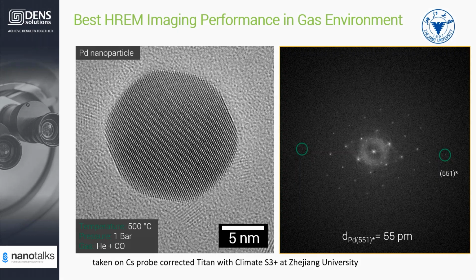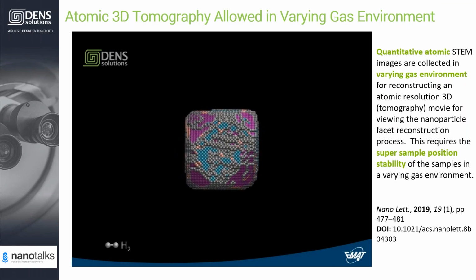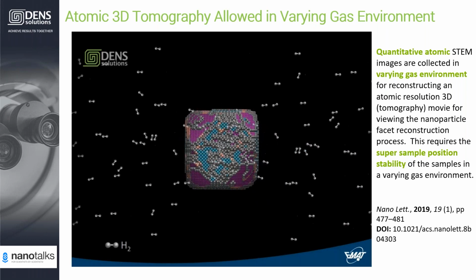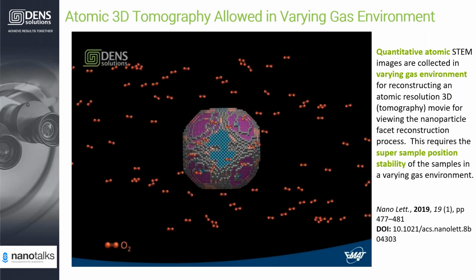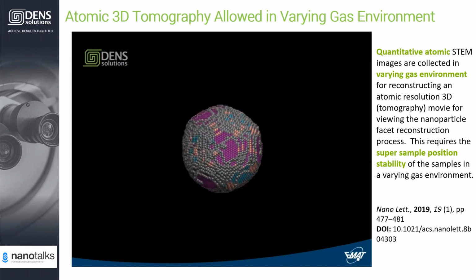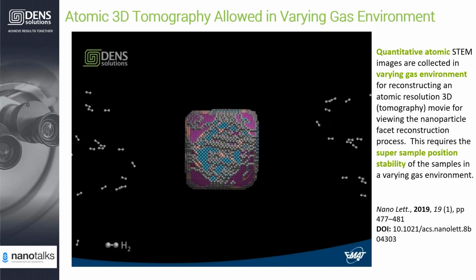By looking at the diffraction patterns as you heat up, the nano islands, of course, start expanding. So then you can correlate the changes in the diffraction to the temperature. And we've done this, for example, with varying gas conditions to also account for the different thermal capacities that you will have with different gases.